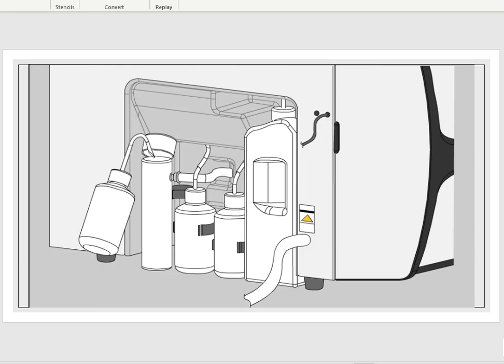And when I keep talking about this sidearm, I'm talking about the drain hose, of course, that's going to be right there. So here is where you would want to fill it. So I normally add enough water until I visually see some of the water that I'm adding in go through and drain into the waste container that sits down below. But that does go to the dehumidifier part. A lot of people just do not know that, but that is what the purpose of that vessel is for.